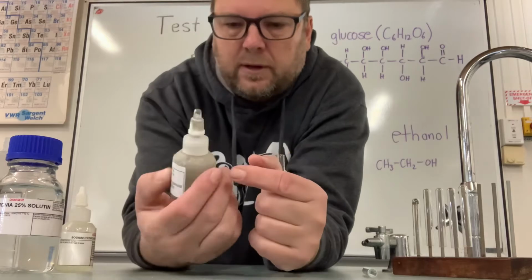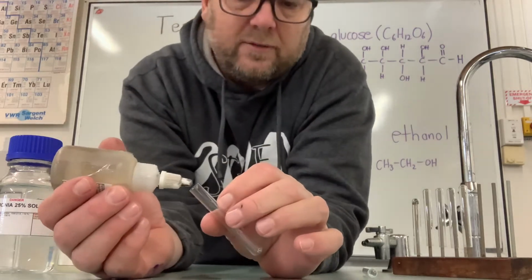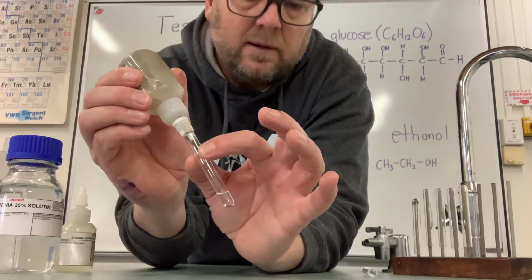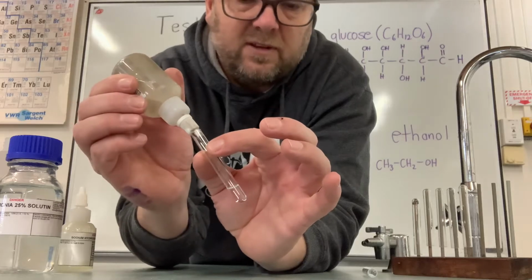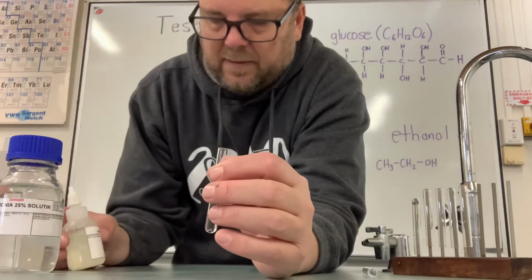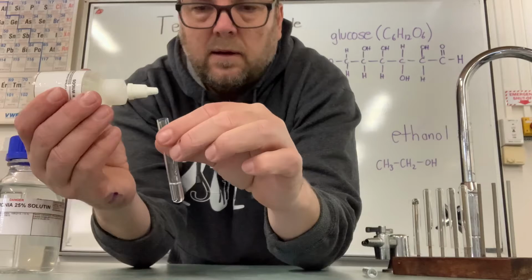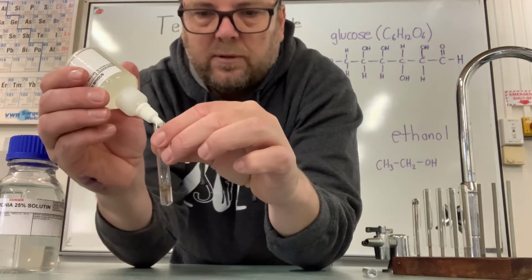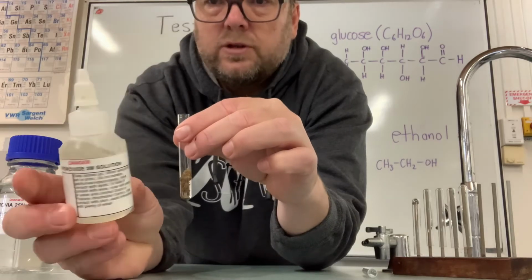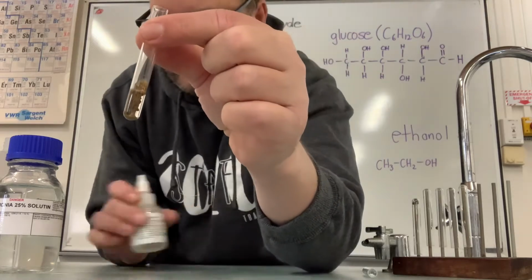And the first thing we do is we add some silver nitrate to that test tube. So we're going to add about 1 centimetre in the bottom of the test tube of silver nitrate. And then we are just going to add a couple of drops of sodium hydroxide solution, and you can see it forms that yucky brown precipitate, which is not what we want yet.